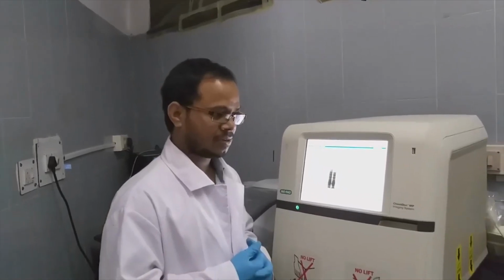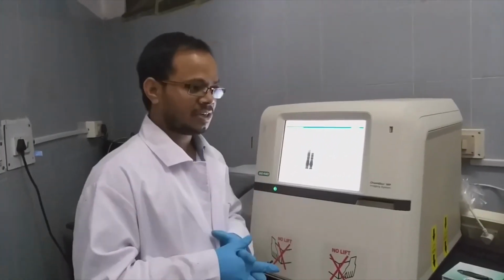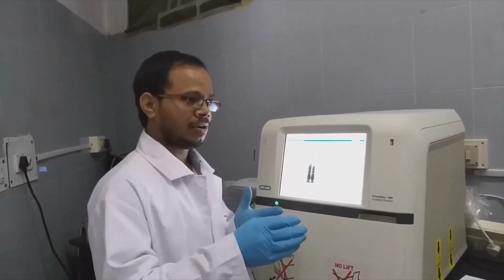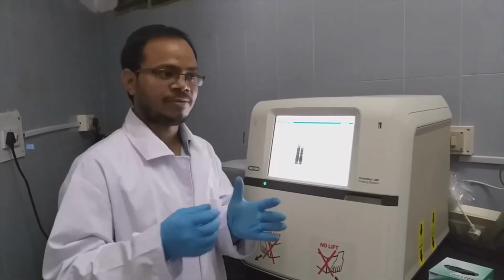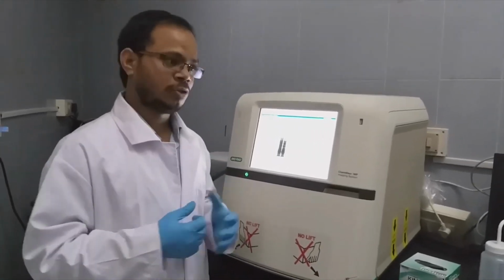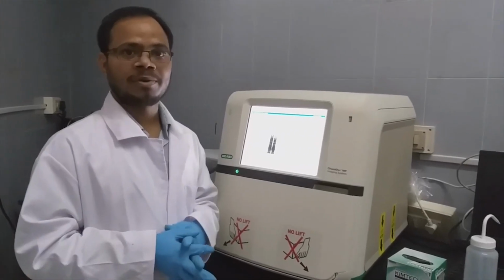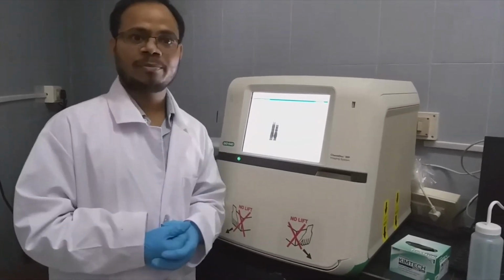These are all the other bands we are seeing in the eluted fractions. Those are because of contaminants or degraded protein. Contaminants sometimes may come because of three or four histidines present in the folded state, which give the possibility to bind to the nickel NTA column. Also, vigorous washing should be done. If you don't wash properly with a high amount of imidazole, that will give you this kind of non-specific binding.